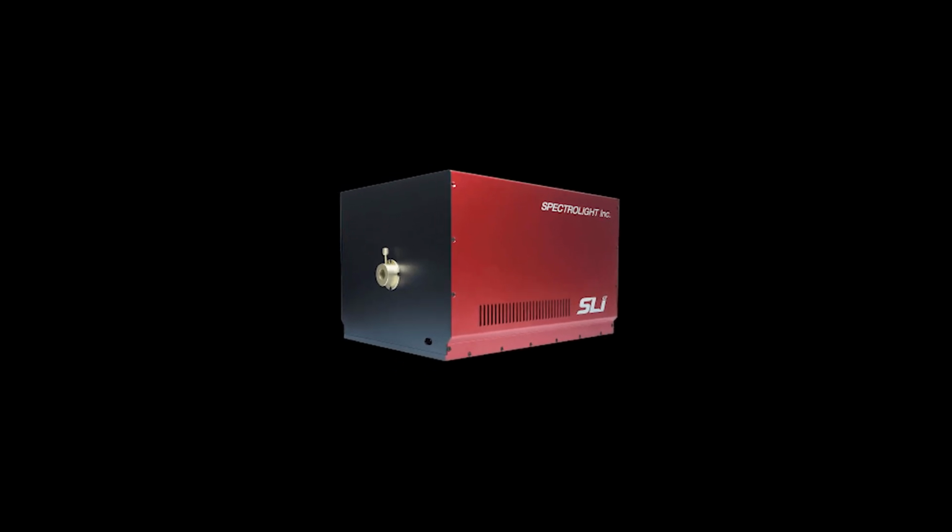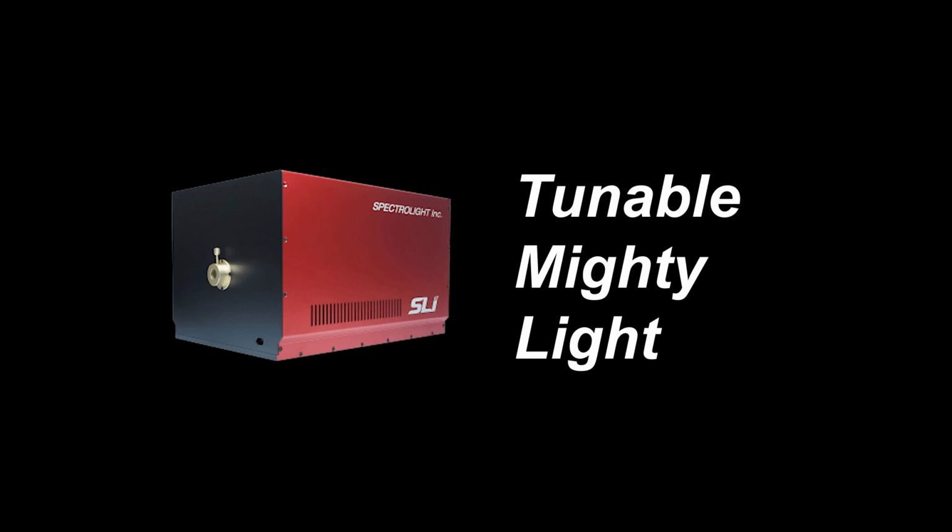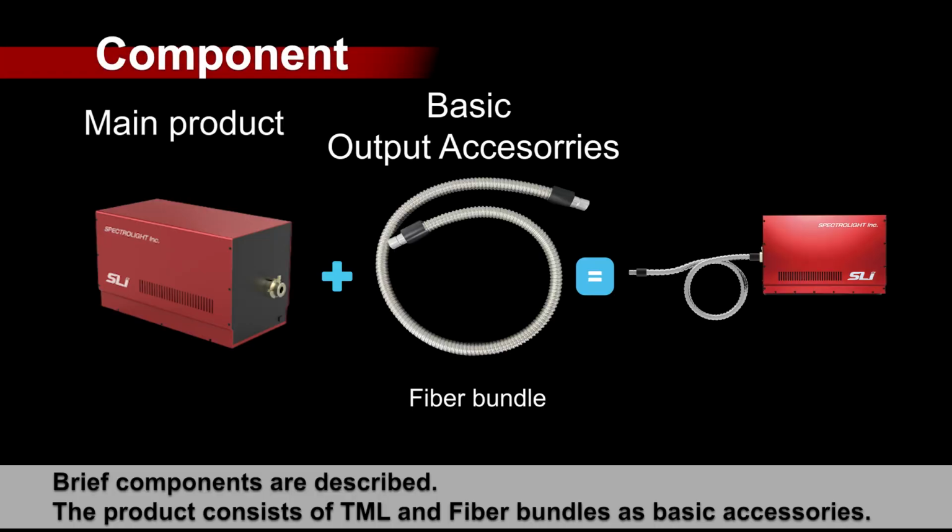Introducing a new innovative, continuously tunable light source. The product name is Tunable Mighty Light, and we call this product TML. Brief components are described. The product consists of TML and fiber bundles as basic accessories.